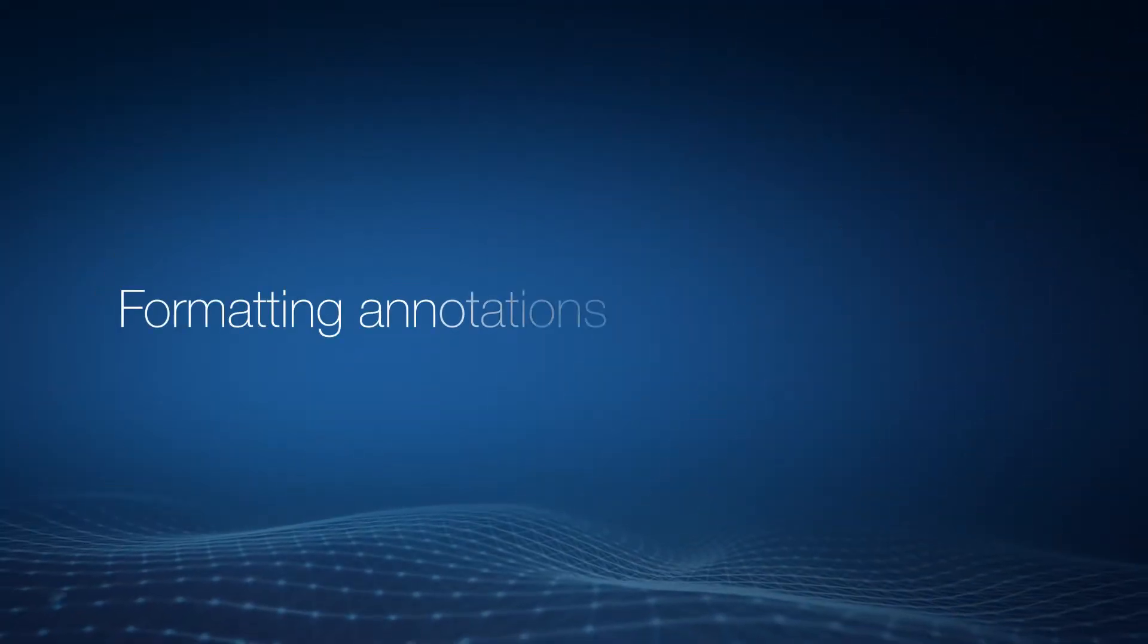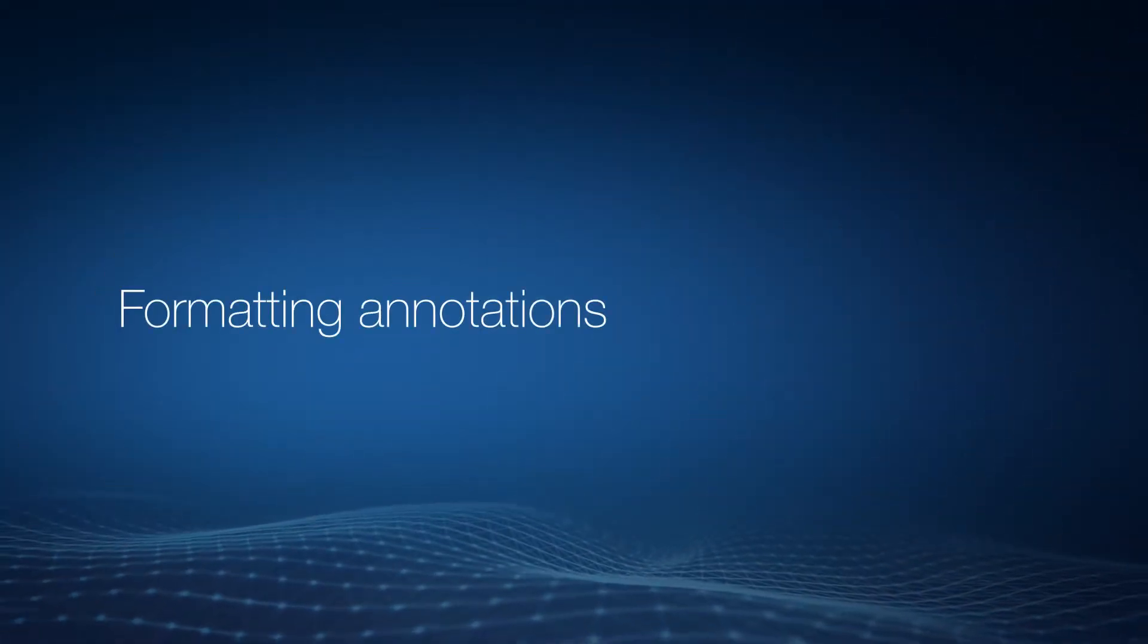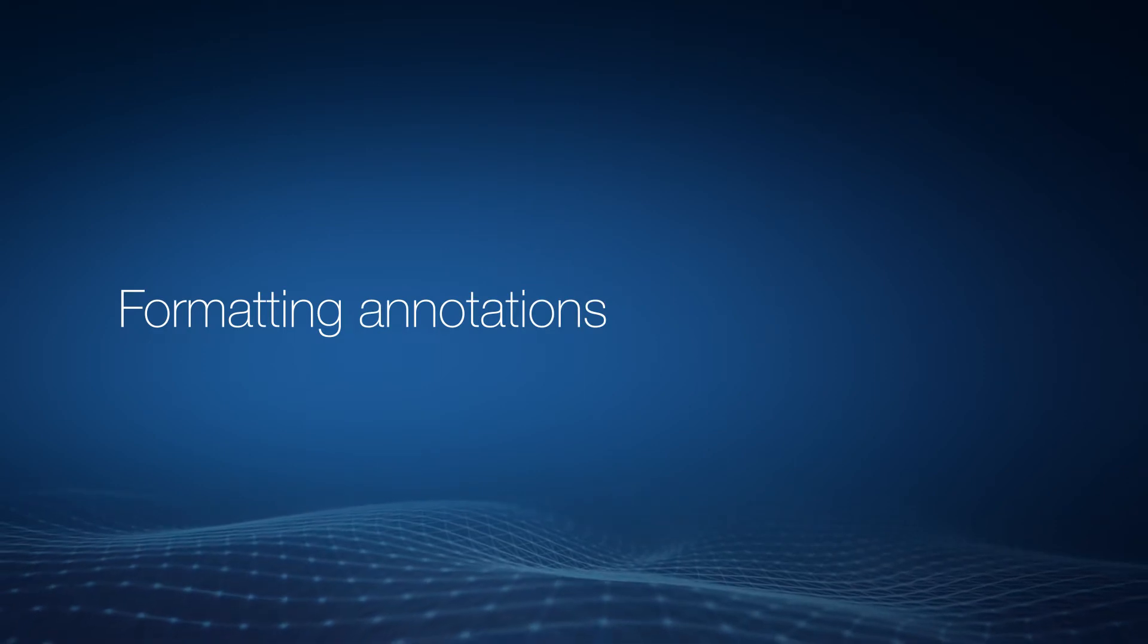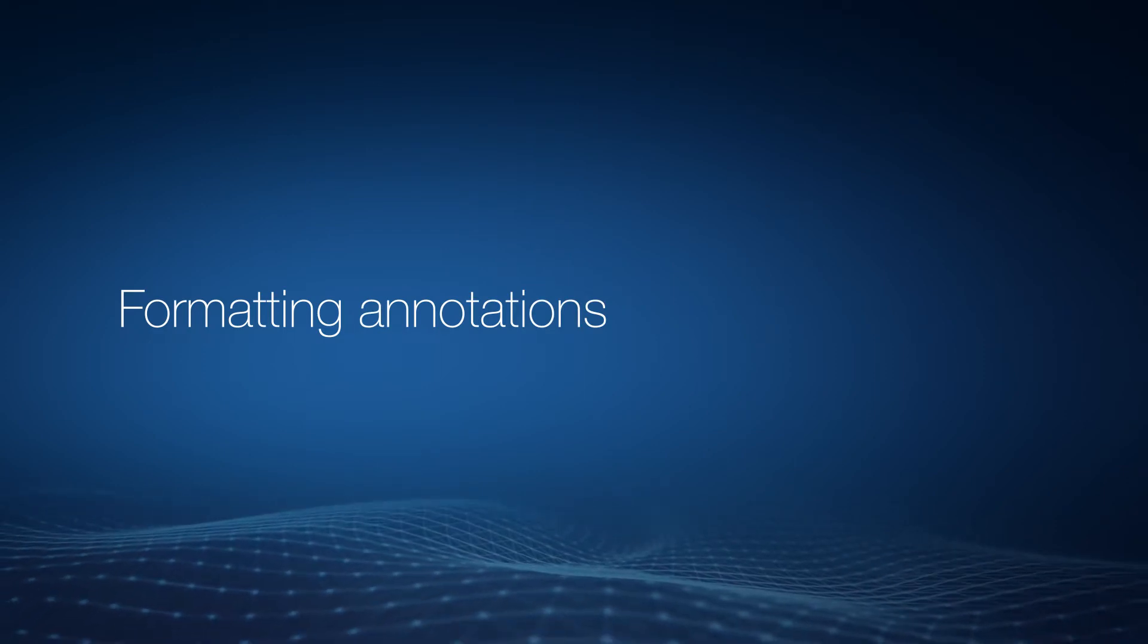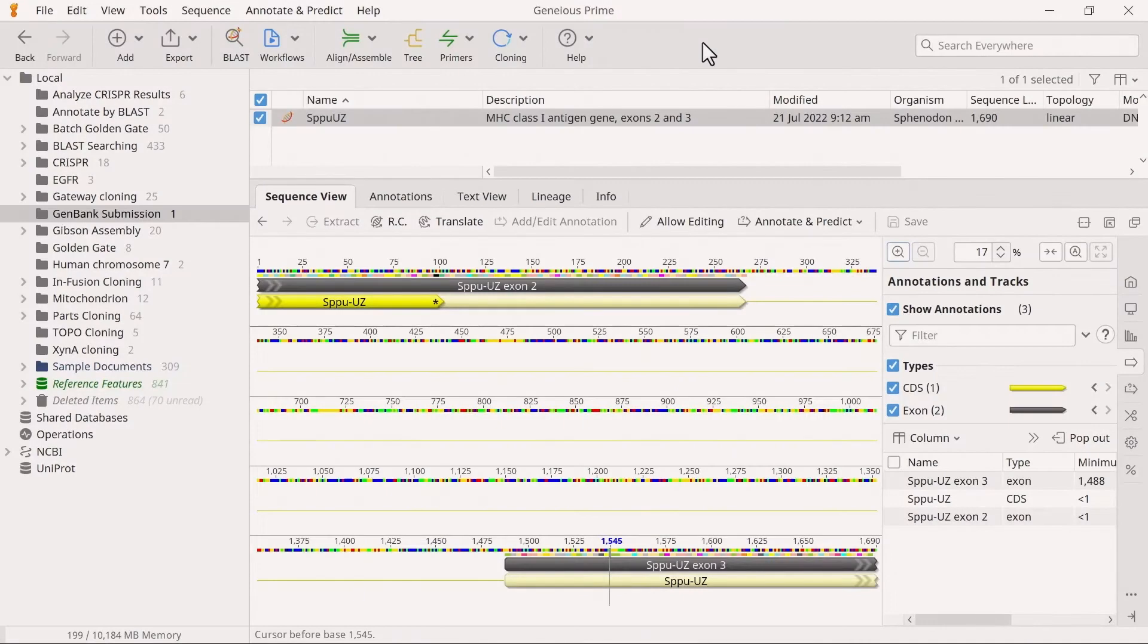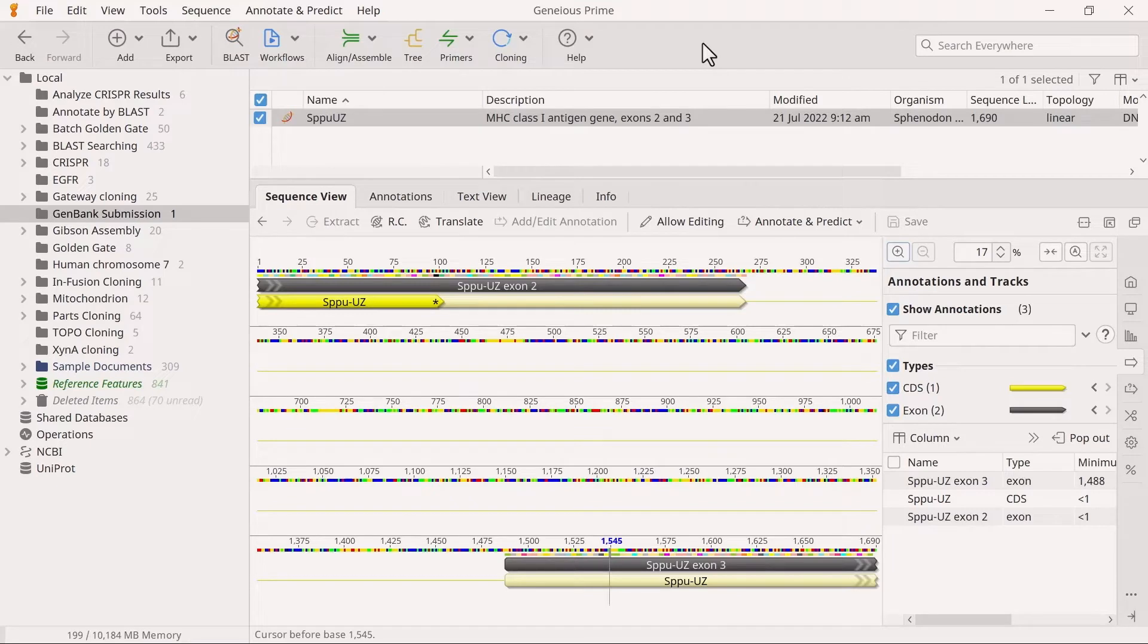With the metadata entered, you can now format the sequence annotations. GenBank records for protein coding genes require information on the coding region, intron-exon boundaries, and protein translation.